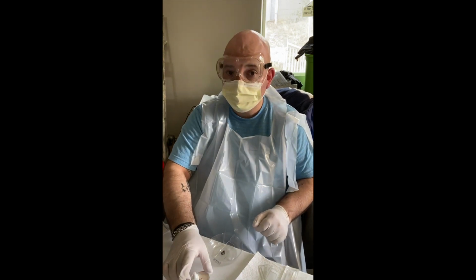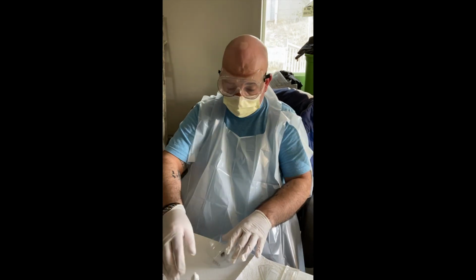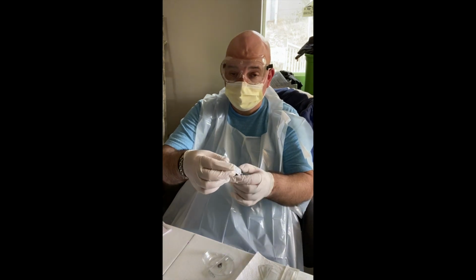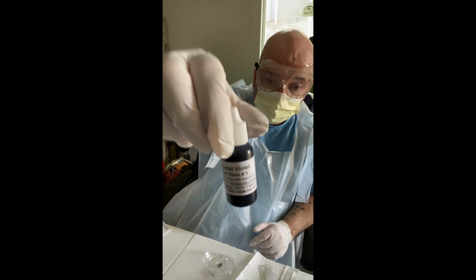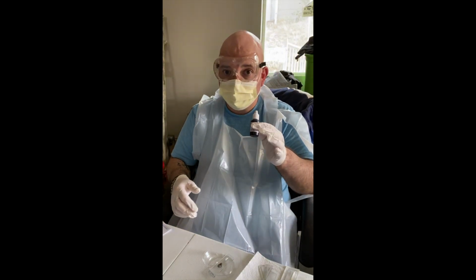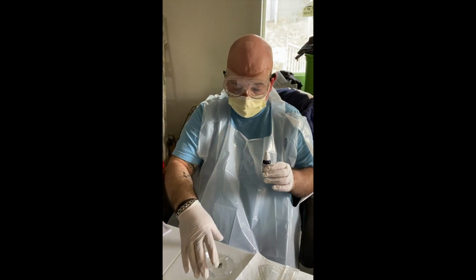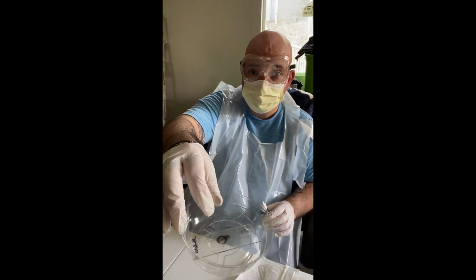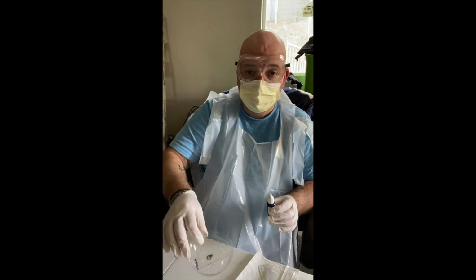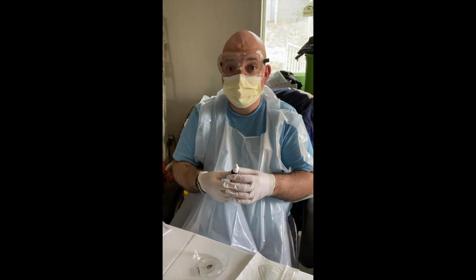And the next thing I'm going to do is I'm going to stain the slide. And I'm going to stain it with a gram stain called Crystal Violet here. So what I'm going to do is I'm going to place 1 to 2 drops right on to my smear, which is the center of the black circle I wrote, and then let it sit for 60 seconds.